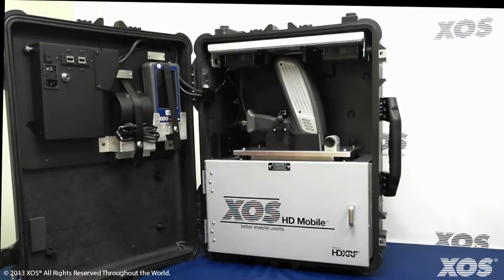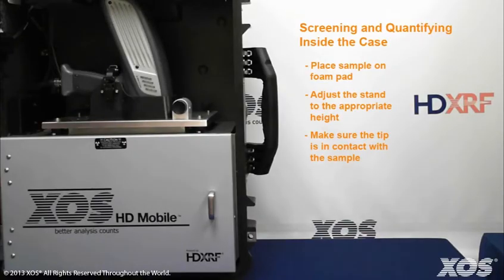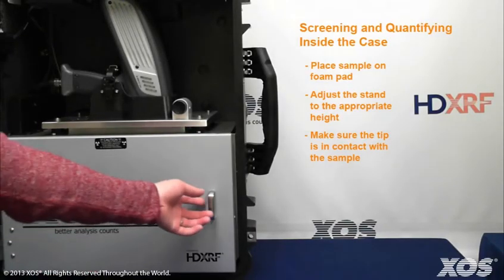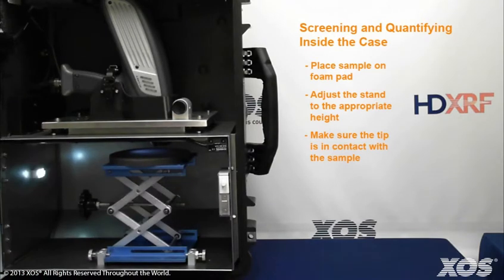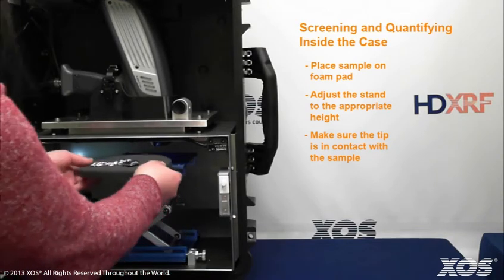Let's walk through the steps for screening and quantifying a piece of metal jewelry. You can take measurements either in or outside the transporter case. To measure this sample — a metal locket — open the sample chamber door and place the locket on the foam pad.